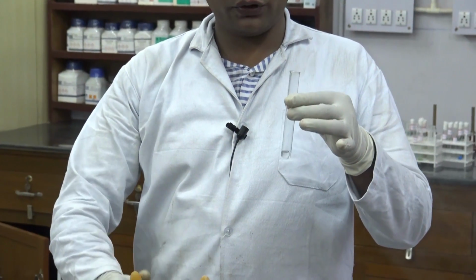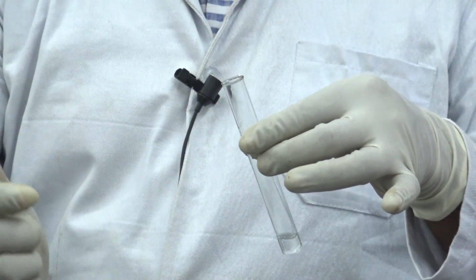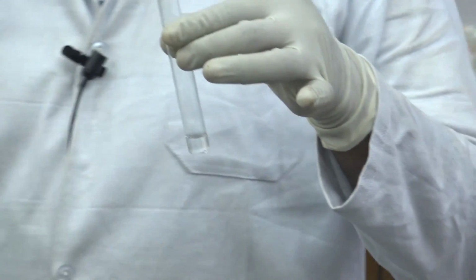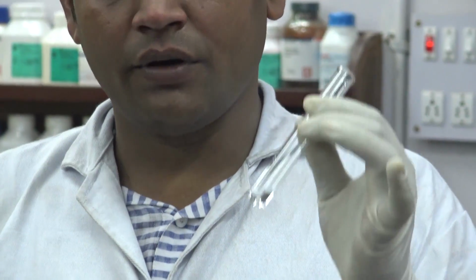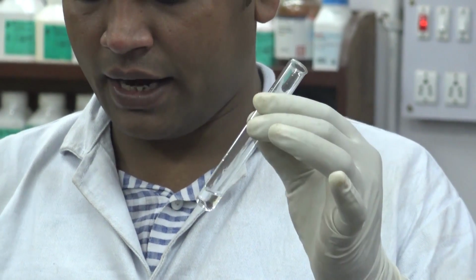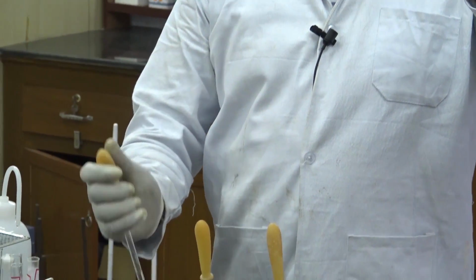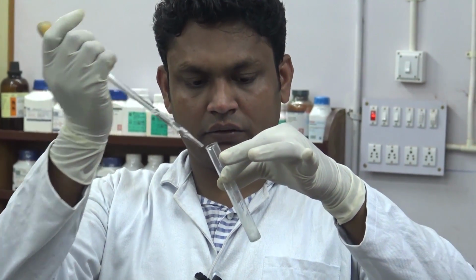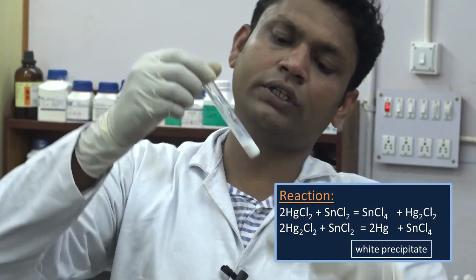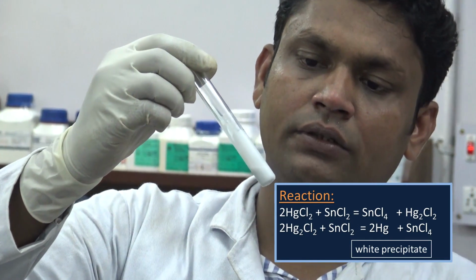For the detection of the mercuric ion, we will add acidic solution of stannous chloride into the sample solution. Here also we can see that formation of the grey or white precipitate appears.